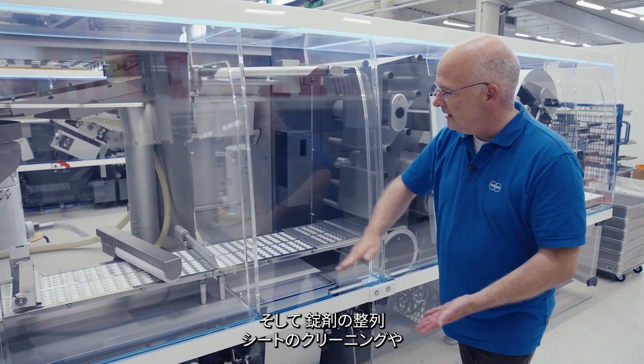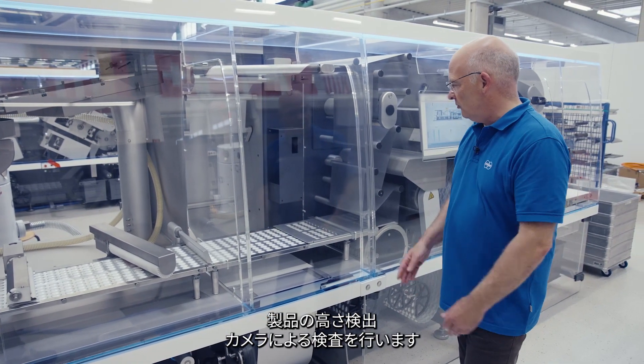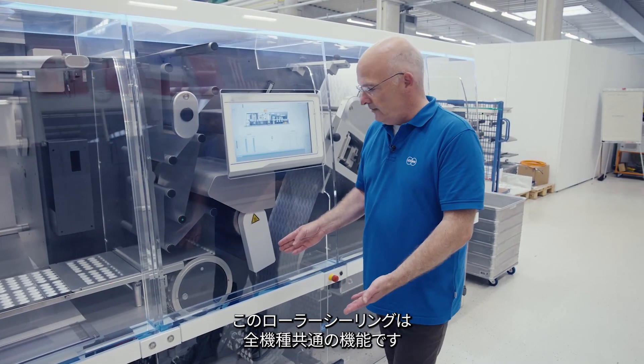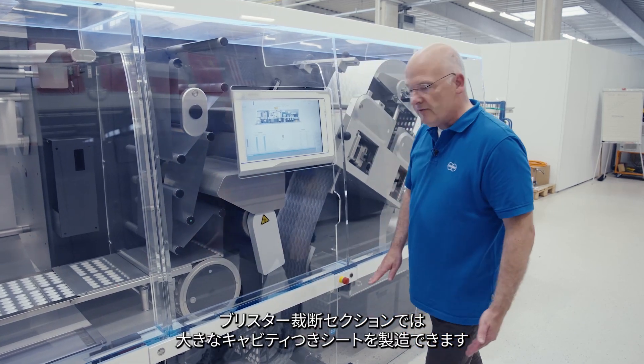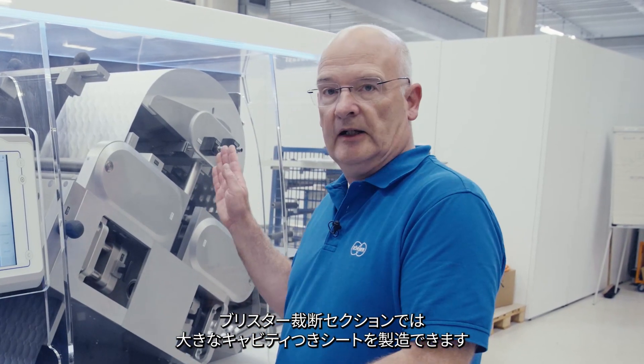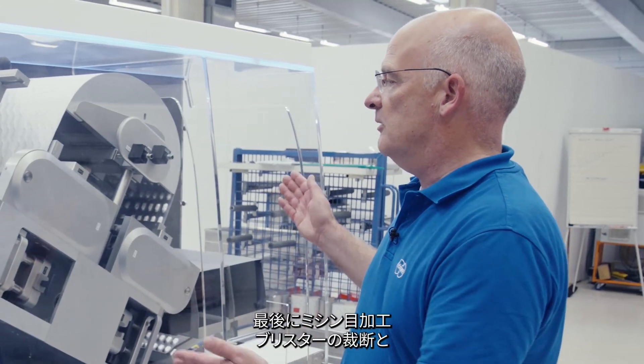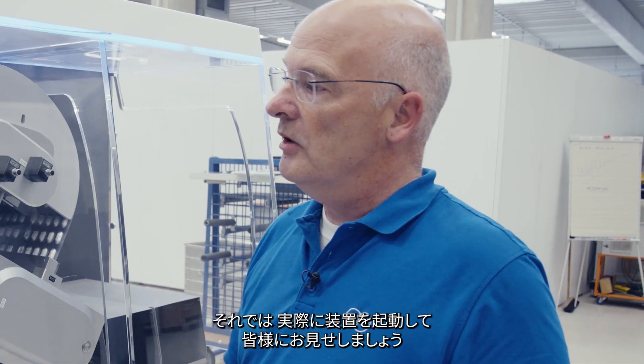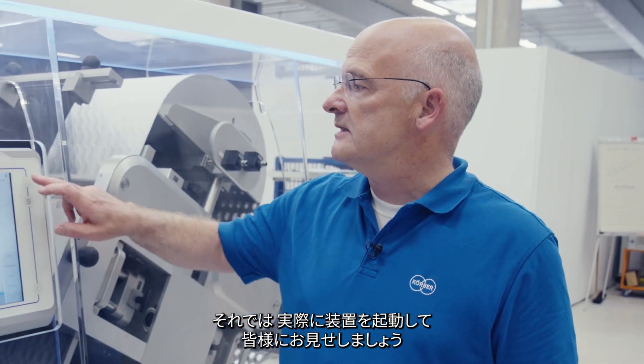Alignment of the tablets, cleaning of the web, product height detection followed by camera inspection, and then roller sealing with the same features on all of our models — the large cavity web is transferred to the blister cutting section. Finally we have perforating, blister cutting, and transfer of the packs out. I will give an impression of the machine and start it for you running.